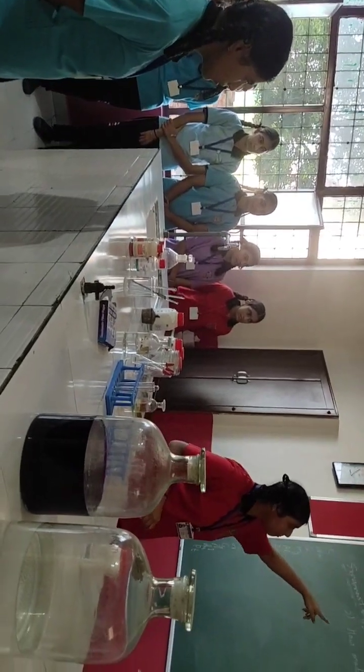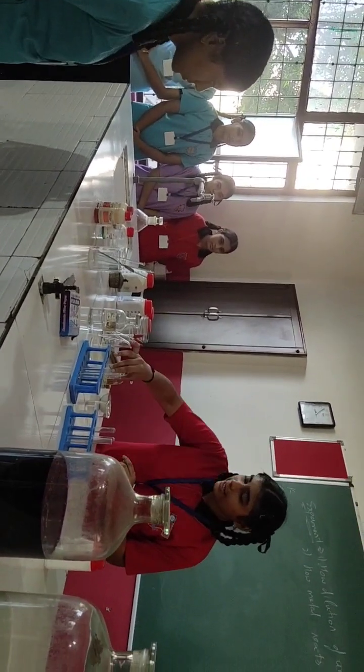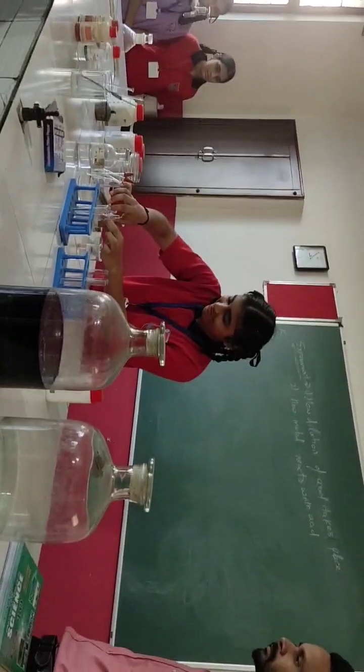And next is how metals react with acid. Here we have taken dilute HCl. No, that is dilute. This is water. Okay.